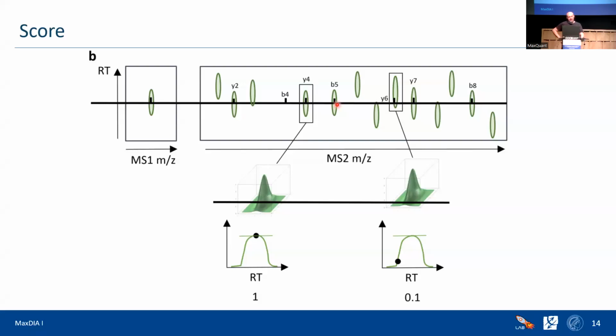The result is again a continuous score, the output of the support vector machine, which replaces this simple score. The simple score we still do in the first round of the bootstrap workflow, and in all the other steps, we train a new support vector machine based on the data of the previous round. Then we use the output of the support vector machine as a new score.